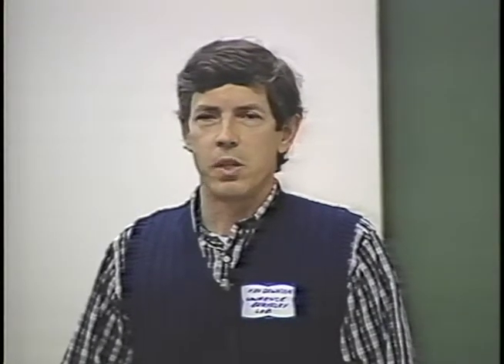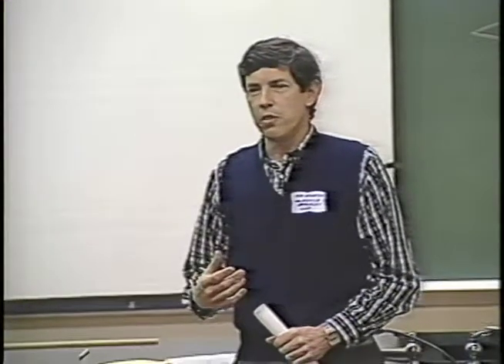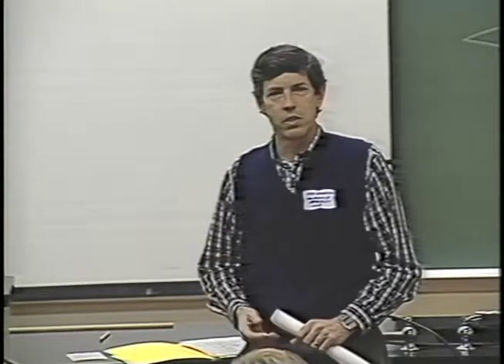And what I want to do is review the factors that influence the resolution and give you some background on the importance of different things. And then to go through some of the operational protocols or considerations that one has to keep in mind when you're trying to record data at high resolution from organic specimens that are sensitive to radiation damage. So the background of my work is basically electron crystallography of thin protein crystals.